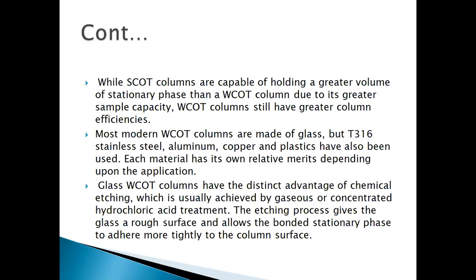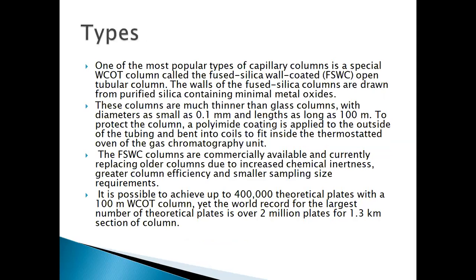WCOT columns have a distinct advantage of chemical etching, which is usually achieved by gaseous or concentrated hydrochloric acid treatment. The etching process gives the glass a rough surface and allows the bonded stationary phase to adhere more tightly to the column surface. One of the most popular types of capillary column is a special WCOT column, which is called a fused silica wall coated FSWC open tubular column.